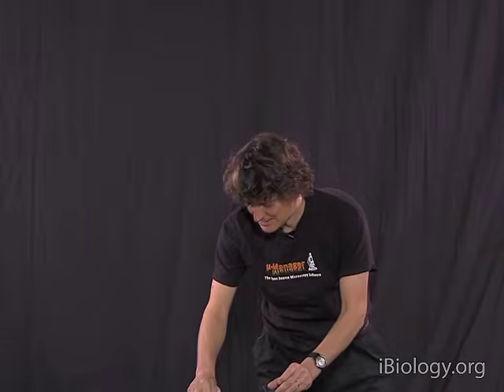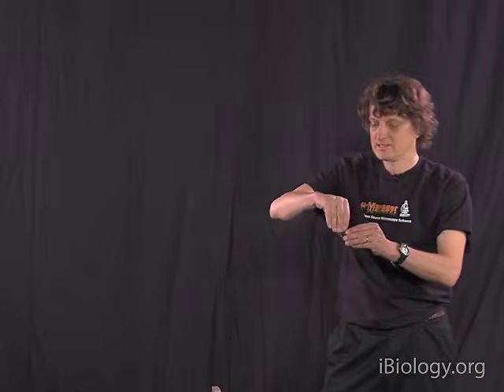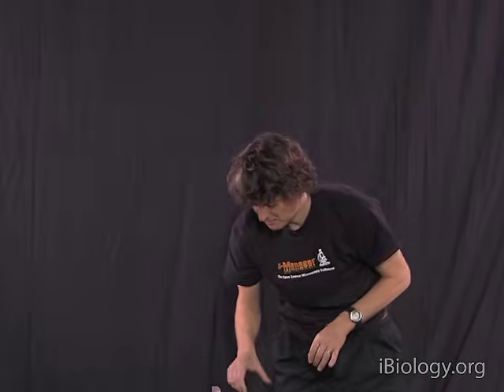And then the last part is this emission filter that will transmit the green light and reject the blue light. So in effect, when we would now place these three in this configuration in the microscope, illuminate from this side, go up, we have the objective and the sample here, come back through and go through this emission filter. That's the principle of a fluorescence microscope.